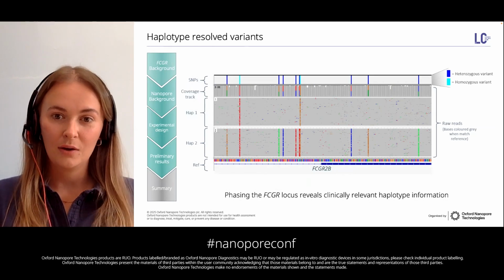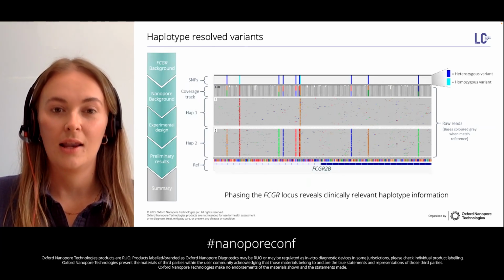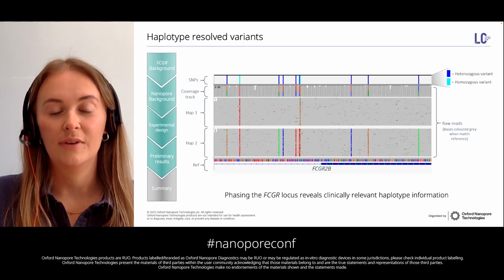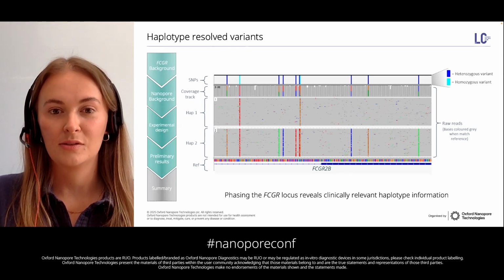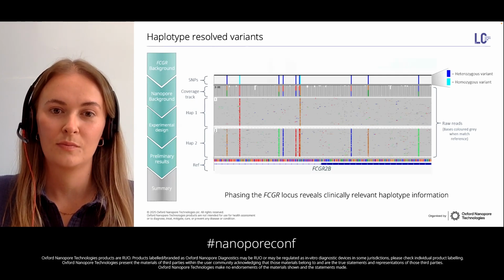Nanopore sequencing now makes it straightforward to resolve these haplotypes across the highly homologous genes. And importantly, it opens the door to investigating a broader set of potentially regulatory variants whose functional effects may have been missed or overlooked due to previous technical limitations.